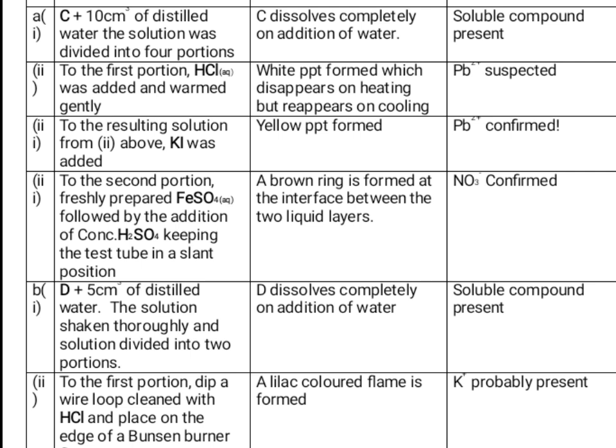This is a sample table containing the likely questions to expect in this year's NECO chemistry practicals salt analysis. As usual, the table will be given in the question paper, unlike WAEC, where the students are made to draw the table. But for NECO, the table will be given with the test column filled. Then the students will be asked to fill in the observations and the corresponding inferences.